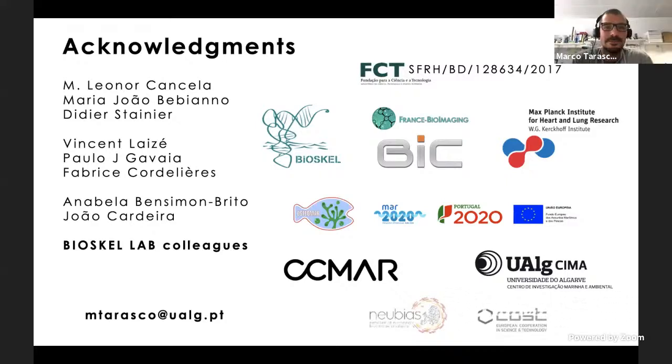Well, the next step, in my opinion, for example, at ZF Bone, we have already started to work to transform the Operculum macro into Java, which took a little bit more time than doing a simple macro. But of course, in Java, we're able to do many things and can even become independent from Fiji. So my dream would be to create my own small software for assessing, for example, bone.